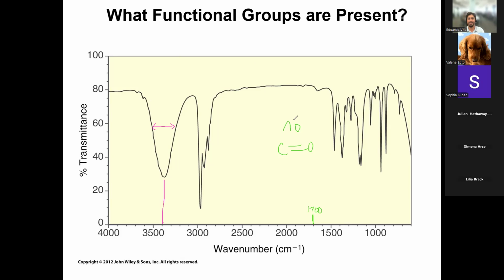Perfect. Yes, this is a standard, representative, stereotypical, iconic OH signal right here.